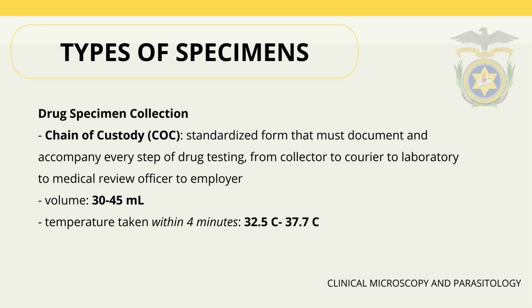The volume for drug specimens is recommended to be 30 to 45 ml, and the temperature should be taken within 4 minutes, and it should be 32.5 degrees Celsius to 37.7 degrees Celsius. If the temperature is outside the recommended range, this may indicate contamination.